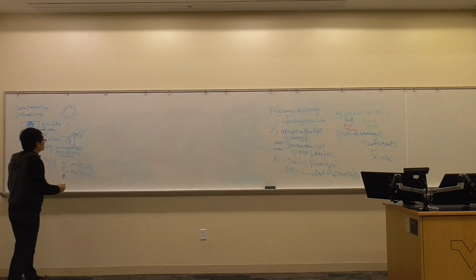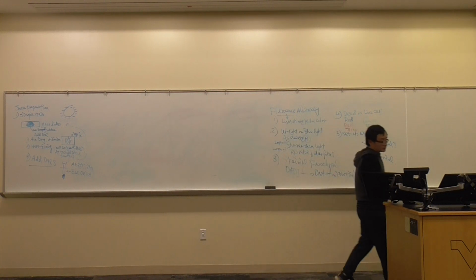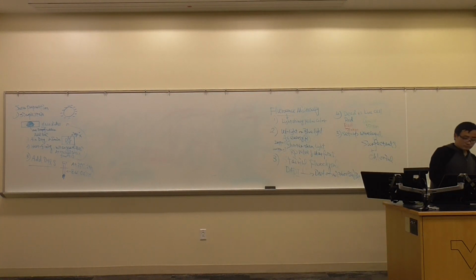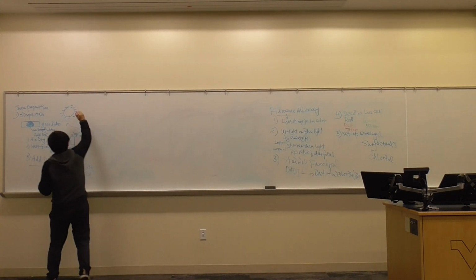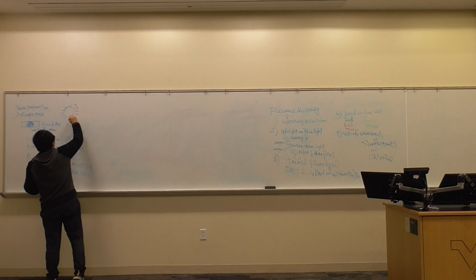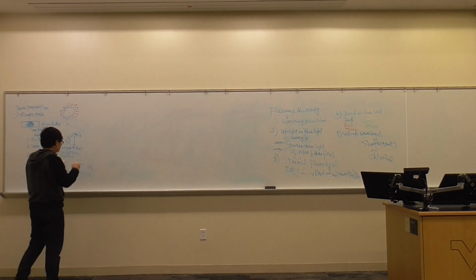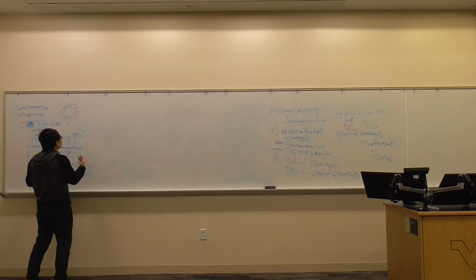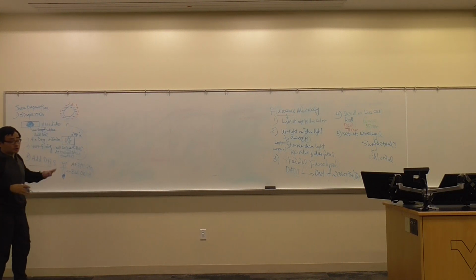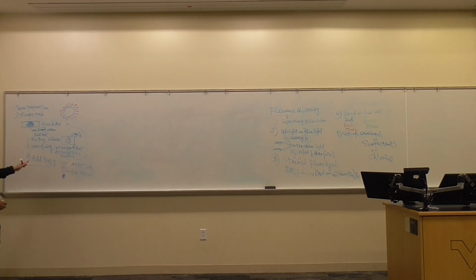And we can put a dye there, because all those dyes are positively charged. You can see it right here. It's positively charged. Therefore, positive ions and negative electrons could be attracted to each other, so they could stay together, and I'm showing you the color. So it's a very simple principle behind why we can use a dye.